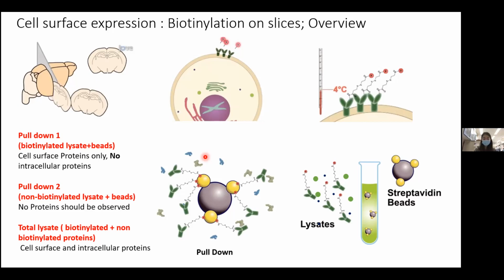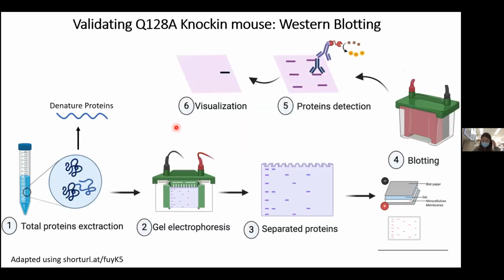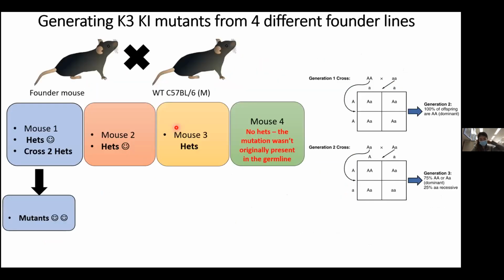All right. Are there any other questions? If not, I have one final one. When you were talking about micro-injecting cells with Cas9, I mean, you can also do electroporation or transfection. I've never heard of micro-injecting.